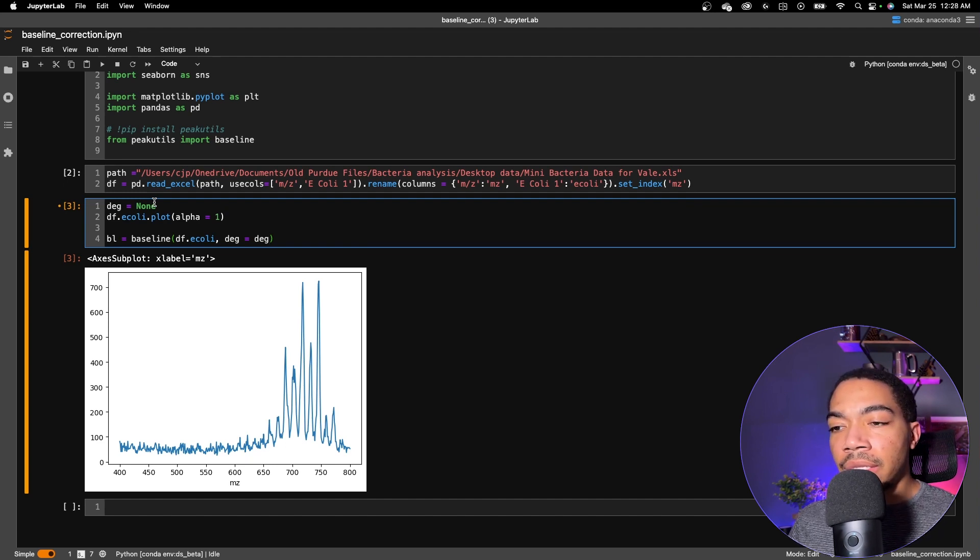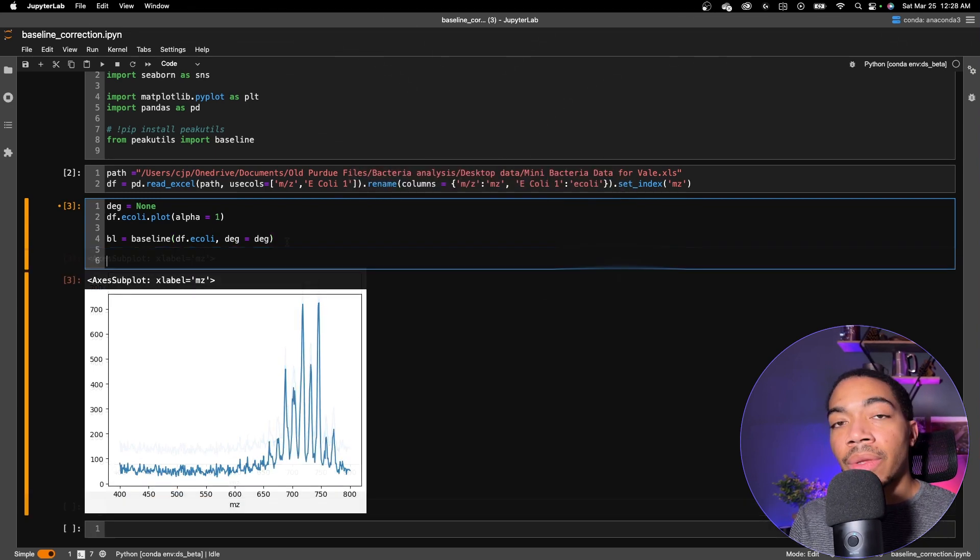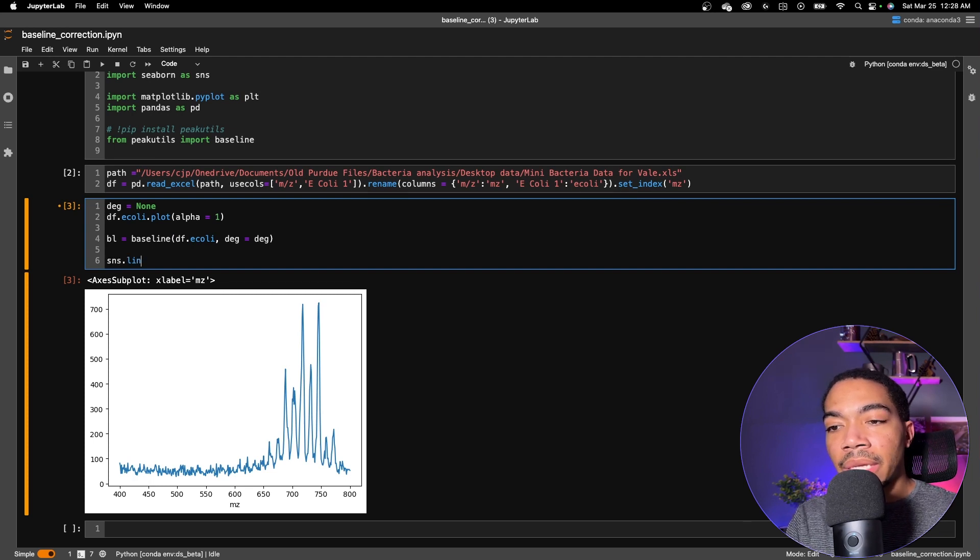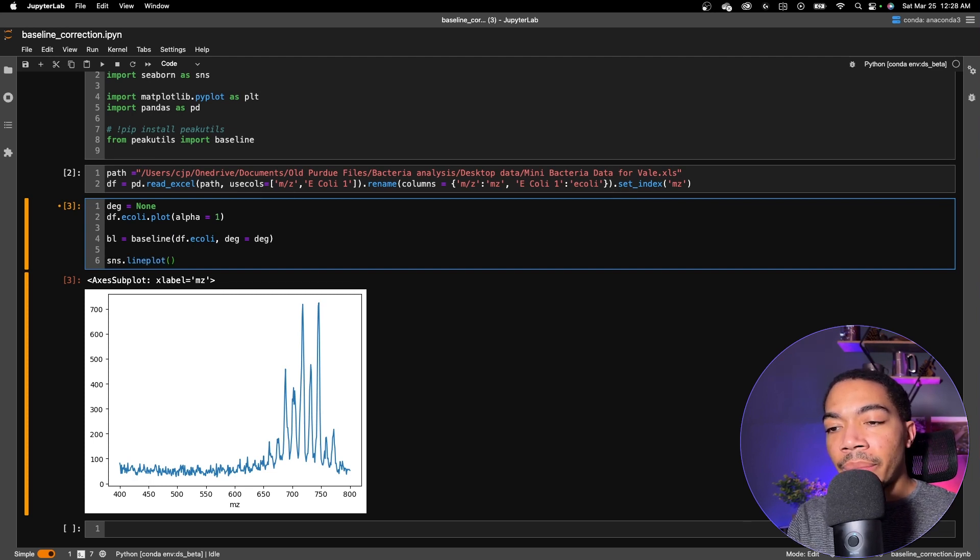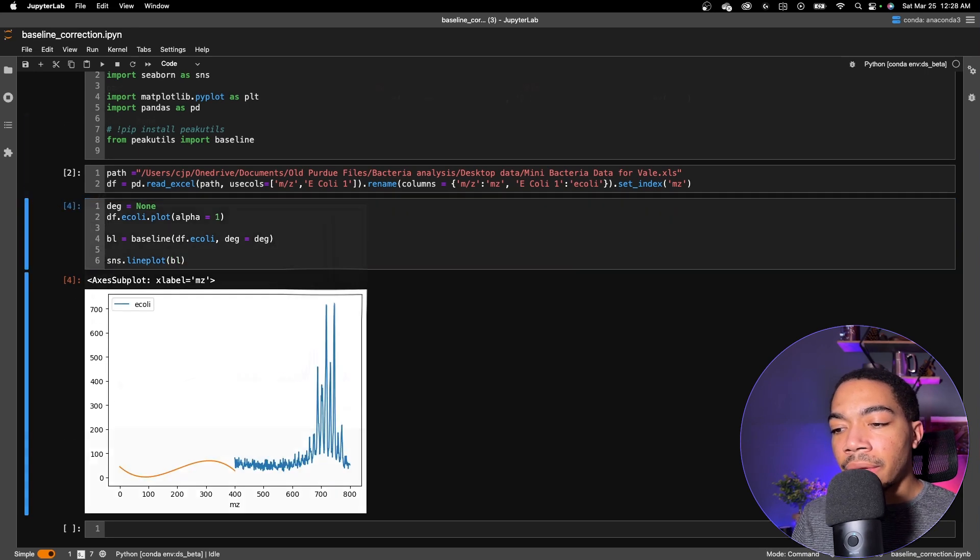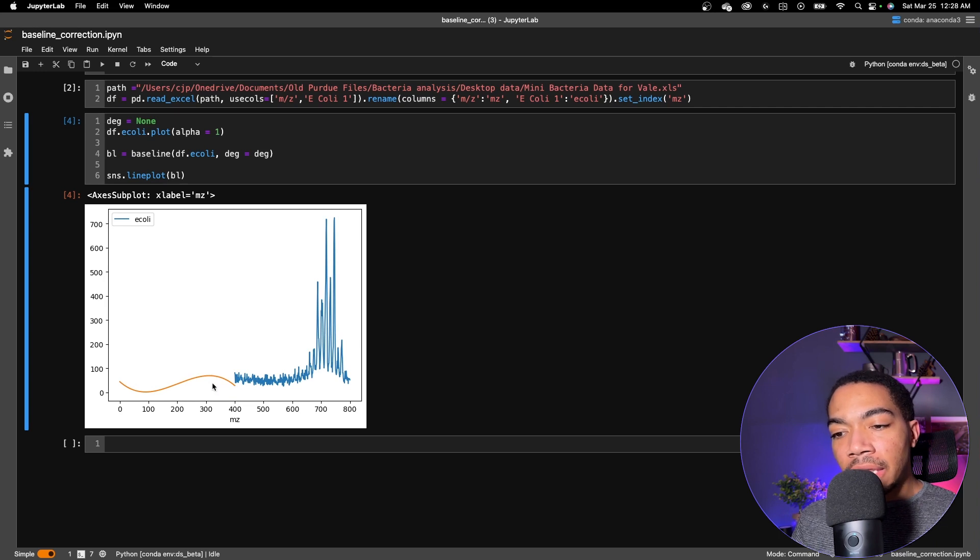So here is the original. So the default degree is none. I'll also add this baseline array to the same plot. We'll do that by using sns.lineplot, passing in BL, and then just plotting that data. So if you notice, when we plot this baseline, it plots between 0 and 400.